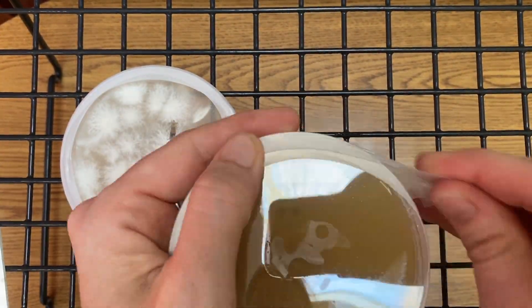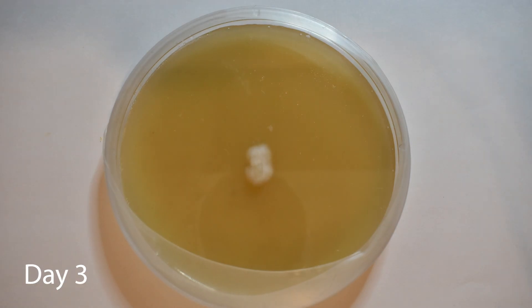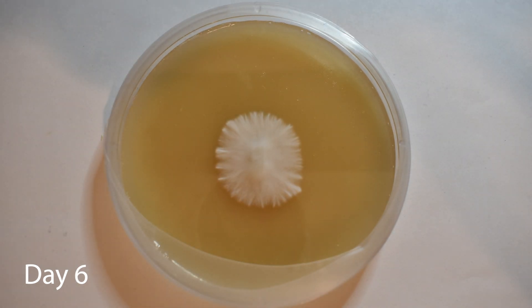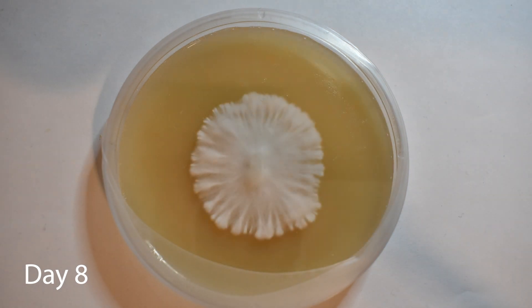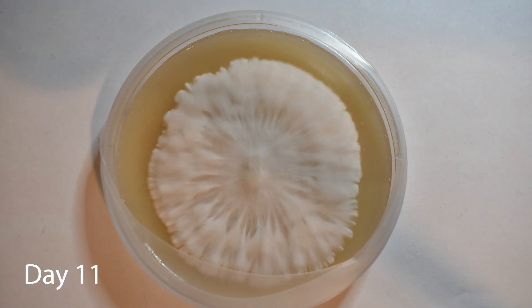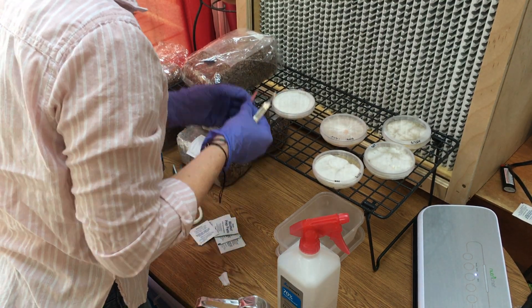Thank you guys so much for watching. We can start to see the mycelium get a little bit fluffy here, so we know there is a little tomentose mycelium too. You could do another transfer to try to get better rhizomorphic growth, but for now I'm just going to transfer the whole puck to a spawn bag and continue to grow it out in the spawn bag.